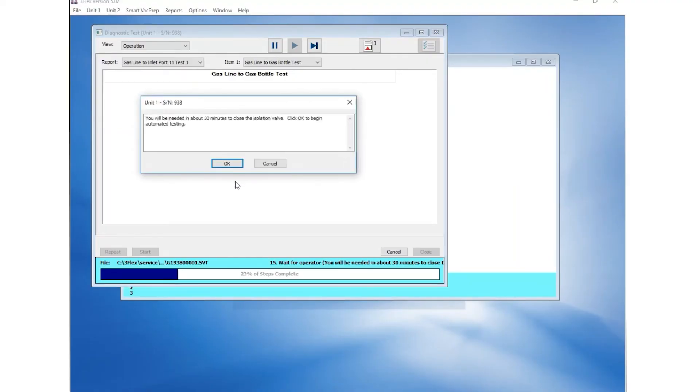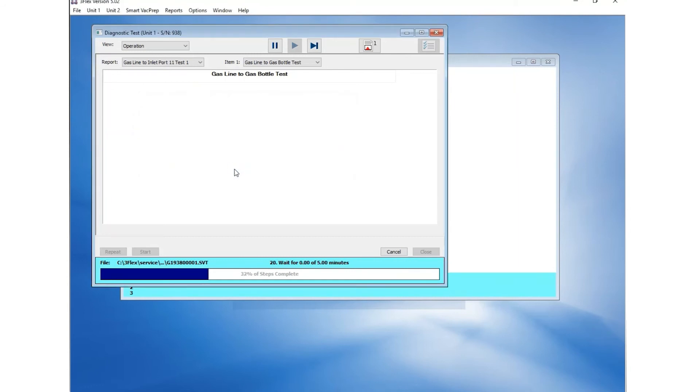You are prompted to return in 30 minutes to close the isolation valve. Click OK to begin automatic testing.